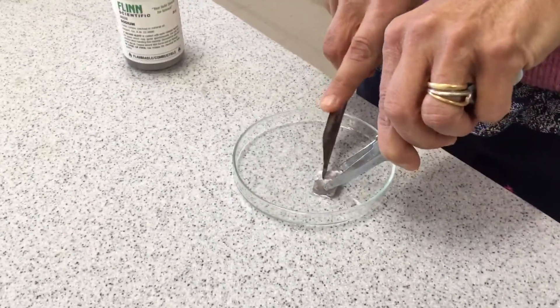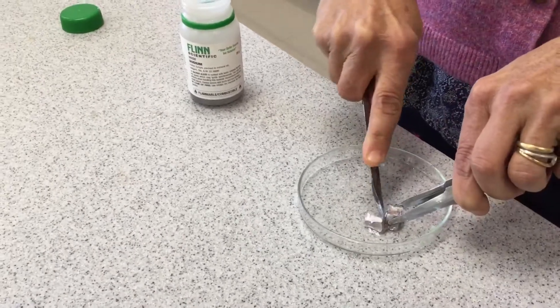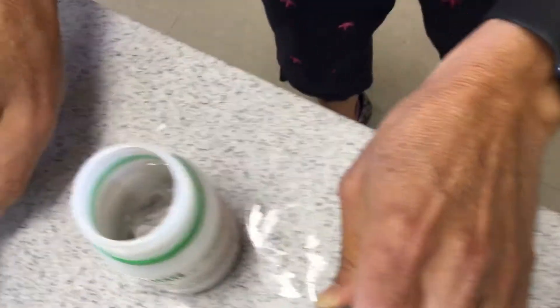Is that too much? I'll just cut a little more off. Again, it's a little bit softer than lithium — it's really soft. I don't have to work quite so hard at it as Ms. Shute did with the last one. And look where it's stored — we'll talk about that in a little bit. In oil.